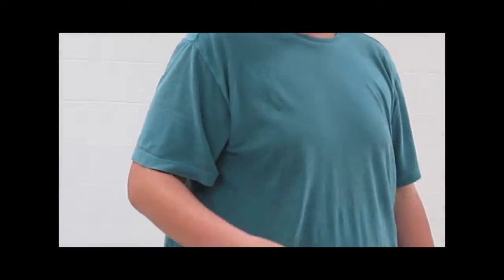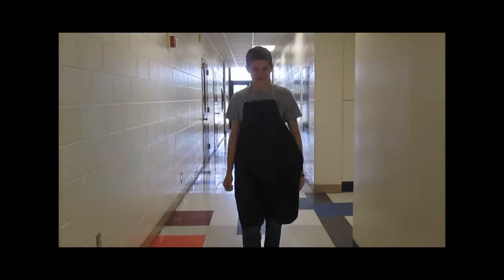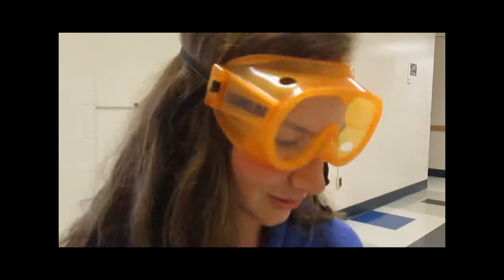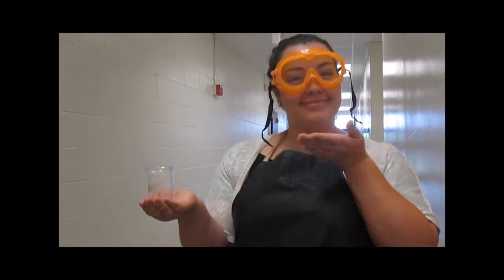Make sure you have appropriate glassware that's capable of standing high temperatures. Also, make sure you wear an apron that can protect against chemicals, spills, and other heated or toxic substances. Make sure you also always wear goggles — it protects against chemicals, spills, and other things that could hurt your eye. All put together, you're ready to roll. Just get the chemicals.